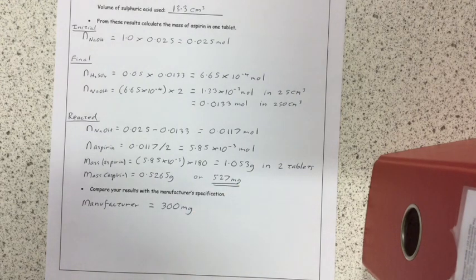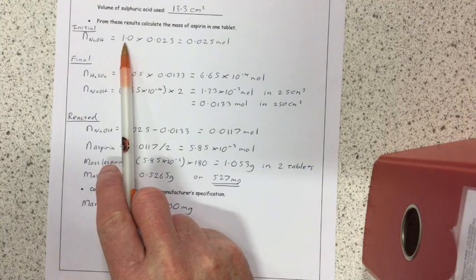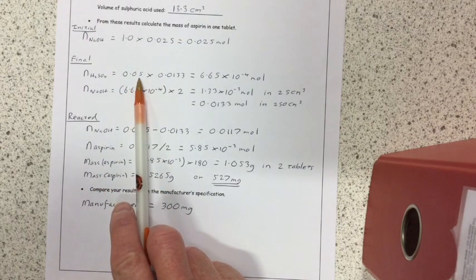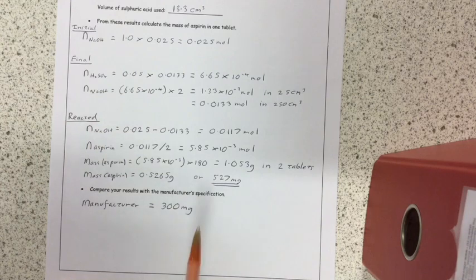So, what possible explanations are there for this? Well, unfortunately, because we didn't have any pure aspirin, we weren't able to run a control experiment. So, we didn't have a control experiment to validate our method. It could be that our sodium hydroxide and sulfuric acid concentrations aren't quite right, and errors in them would have showed up if the control didn't work out. So, I suspect that the one mole per liter sodium hydroxide or 0.05 mole per liter sulfuric acid is perhaps not quite spot on.